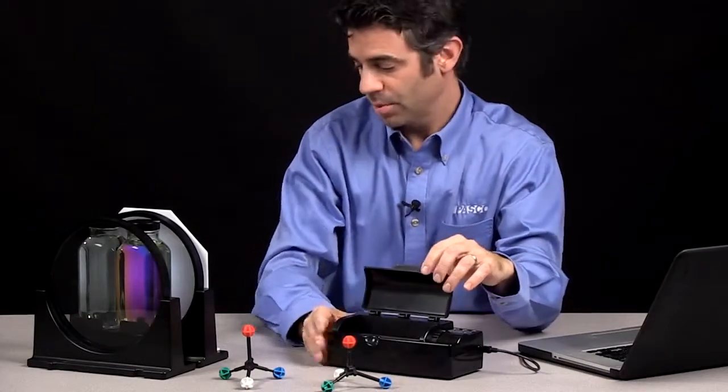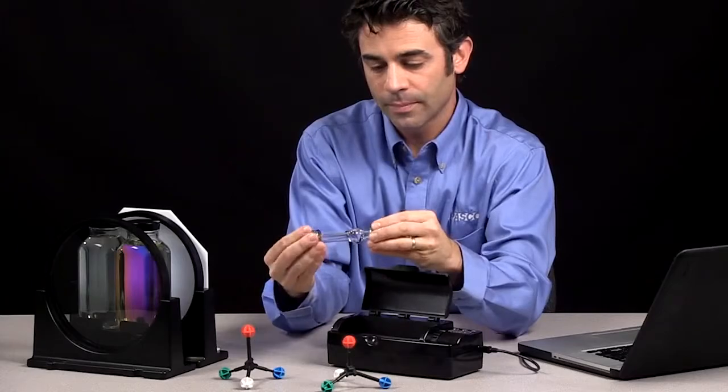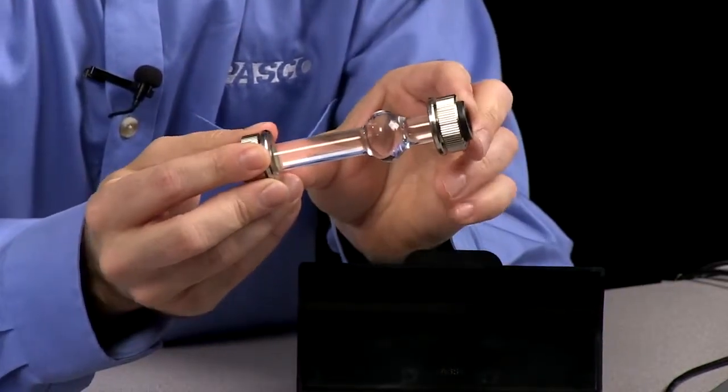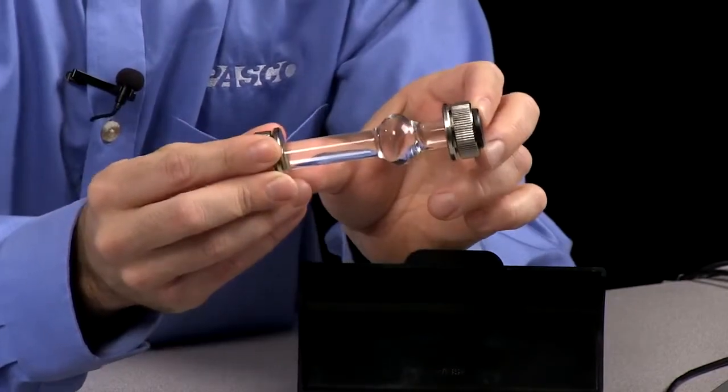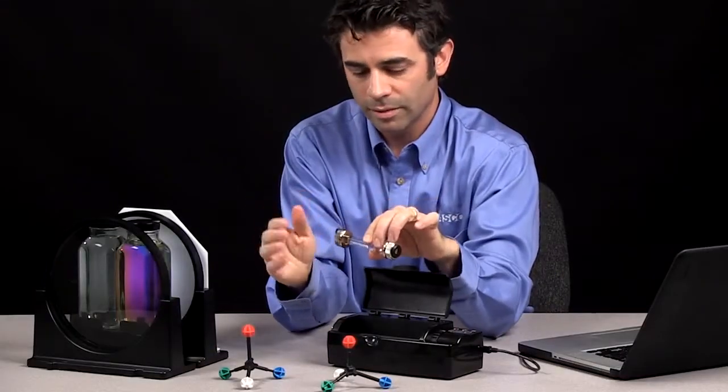Inside, there is a sample cell holder. And here's a sample cell. So this sample cell just has water in it. But it's a 100 millimeter sample cell with quartz ends, so it won't affect any of the light.